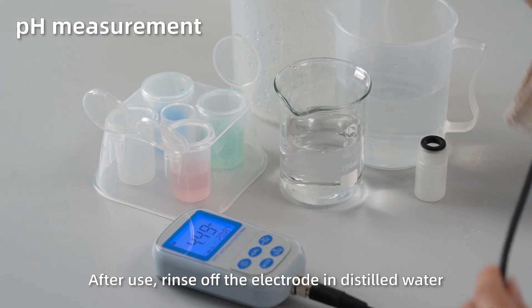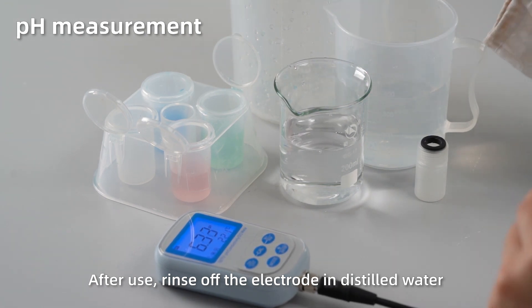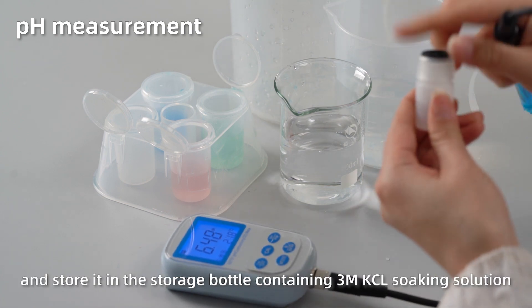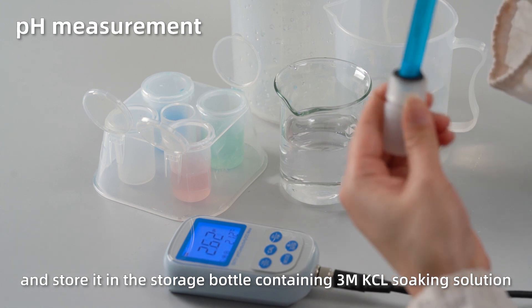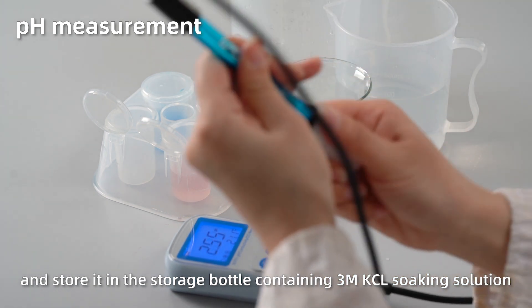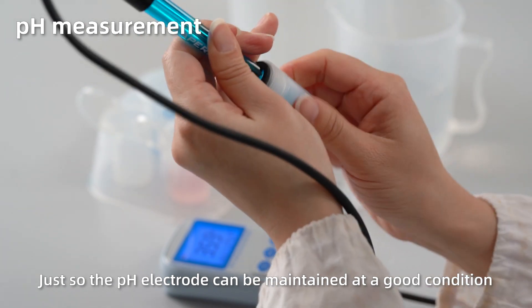After use, rinse off the electrode in distilled water. Place it in the storage bottle containing 3M KCl soaking solution, so the pH sensor can be maintained in good condition.